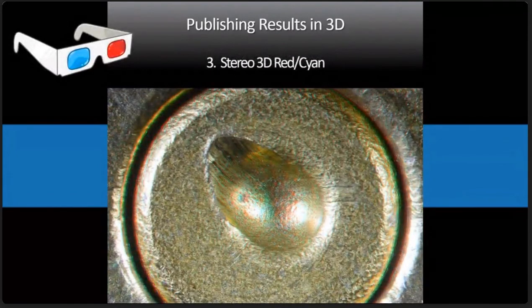Now here, if you happen to have your 3D glasses, please put them on. You put the left eye red, and all of a sudden you will see, if you have them, how powerful the human brain is for dissecting out depth information. A huge part of our brain is devoted to being able to do this. So now all of a sudden you get information you really couldn't get otherwise. Okay, you can take off the stereo glasses now.